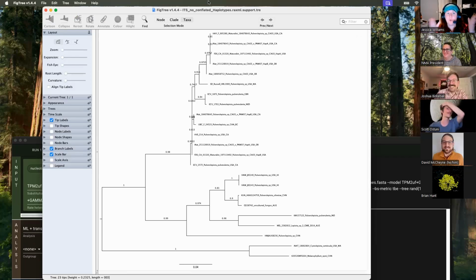I got the forward basically done until it turned into noise. I was so proud of myself. And then I started doing the reverse, and I got maybe 30 base pairs in, and it's another frame shift. Usually all the best you can do there is fill that gap in with Ns in the middle, but in this case you're trying to get each individual haplotype, so that wouldn't even help. That would give you a consensus sequence. I was trying to at least get something approaching haplotypes, but you kind of just can't with a Sanger read like that. It's kind of impossible.